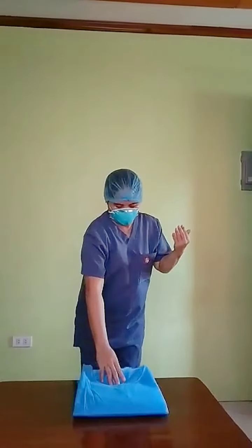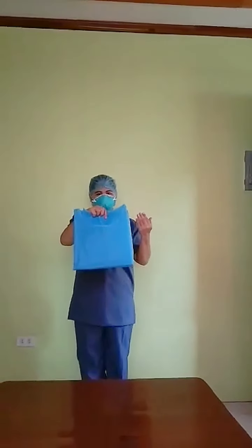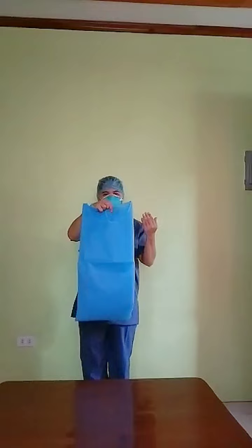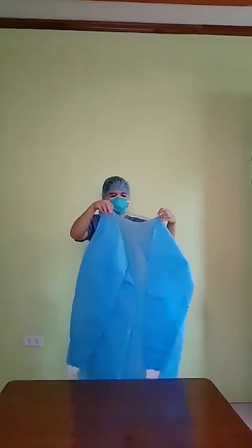First, pick up with one hand the entire folded gown, step back and unfold it, and make sure that it does not touch your body or any other unsterile object. Grasp the inside shoulder seams and slide your arms into the sleeves.